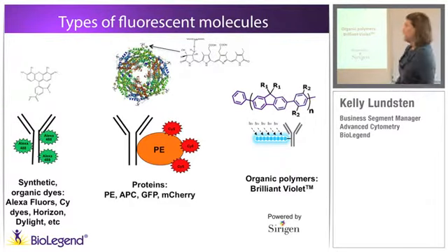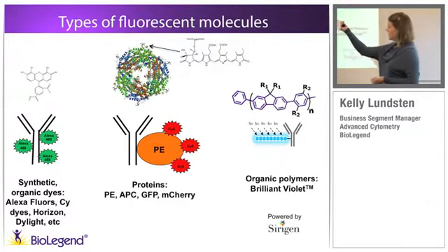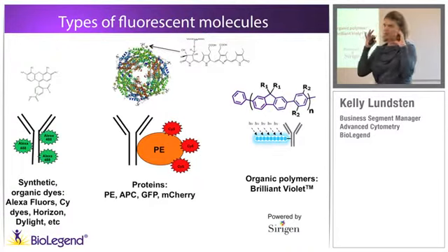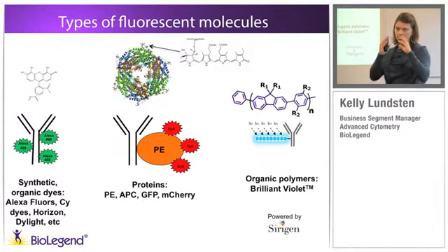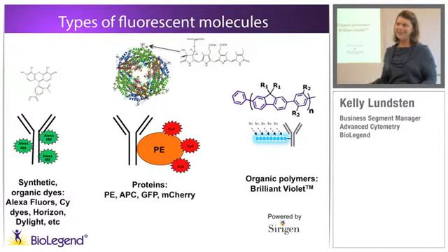So these fluorophores and that kind of very defined small structure, it tunes the wavelength of excitation and emission, but it also limits the amount of energy that can actually excite that molecule. And basic physics always tells us that you cannot emit more energy than you absorb.